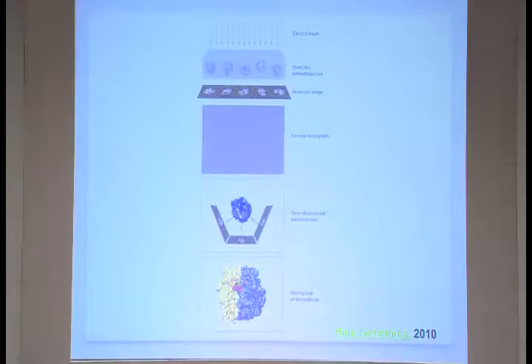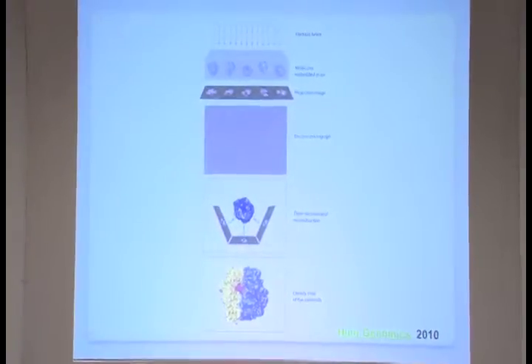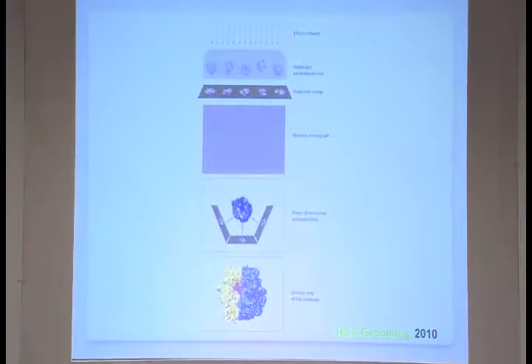Yes, due to some technical achievements and software, these techniques really revolutionized the cryo-EM field almost overnight. So in many projects people get high resolution, near atomic resolution structures, but still we get moderate resolution, say 7 to 15 angstrom maps for different projects.